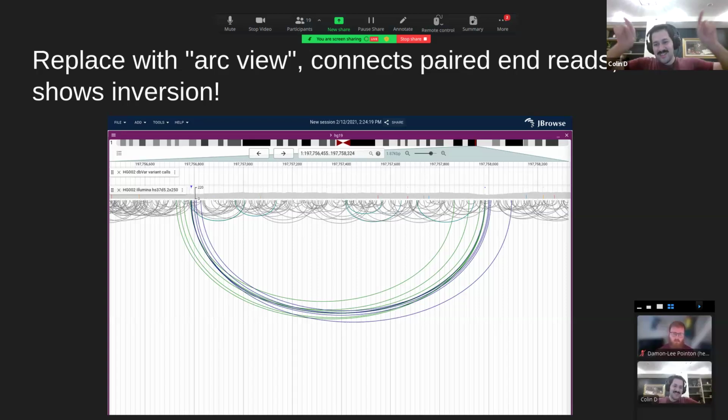The arcs should be small. So you just take the big green arcs, move them together, and then you take the blue arcs and move them together, and it would flip it around.